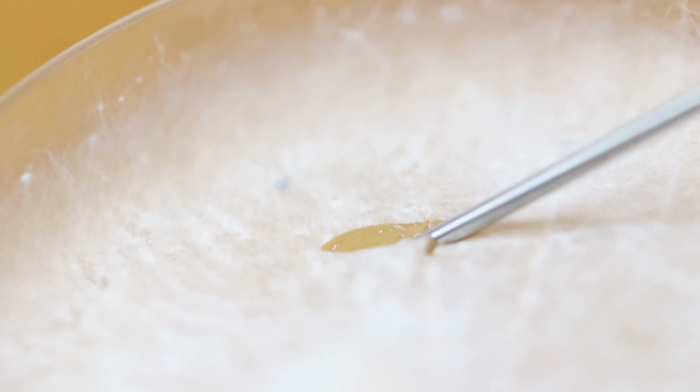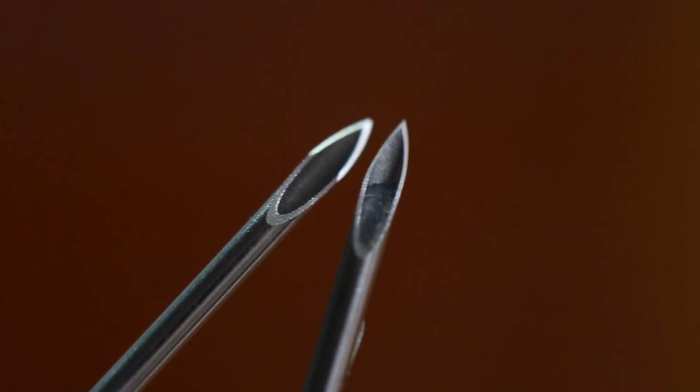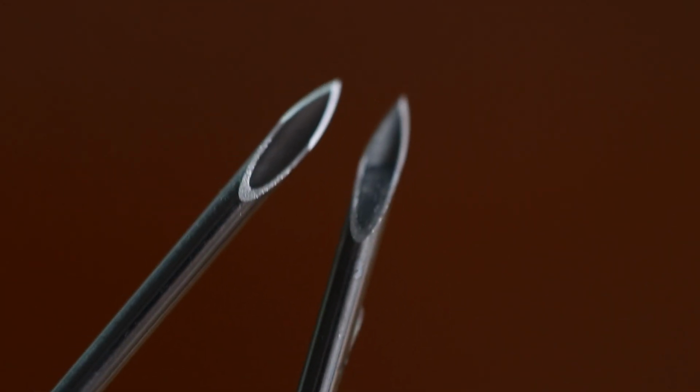Here's a close-up on an agar plate, so you can see how we're smushing and then rotating, levering it out, and now we've got a plug. I'll get you a close-up as well so that you can see the difference, but you really want to make sure that you can see that plug if you can. See, the one on the left, no biopsy. The one on the right has an agar biopsy.